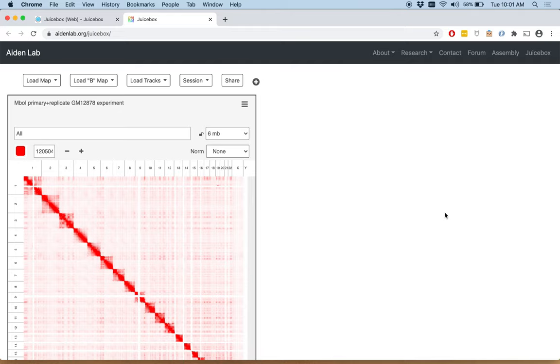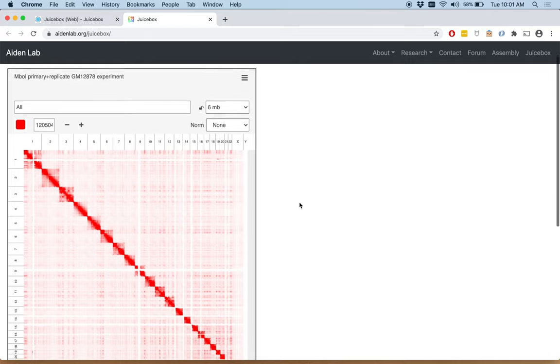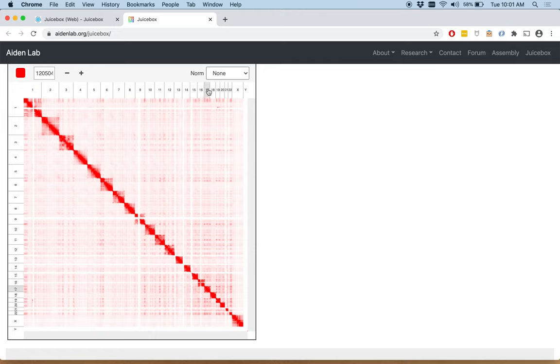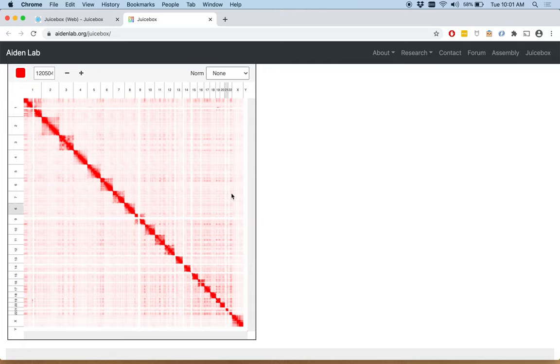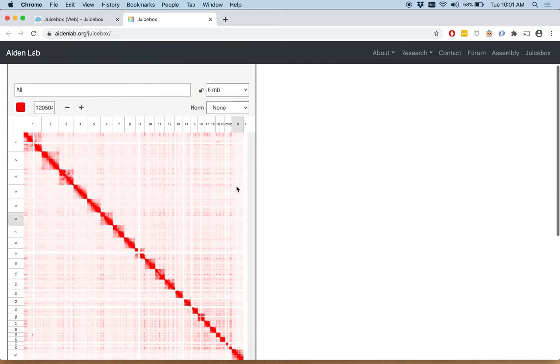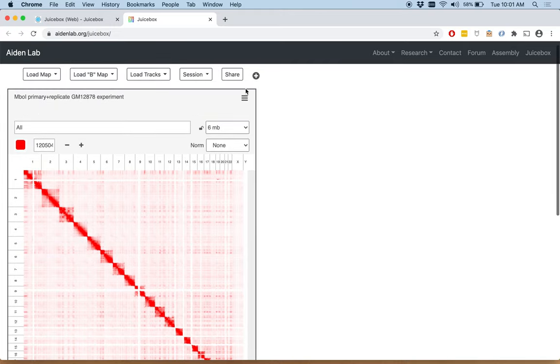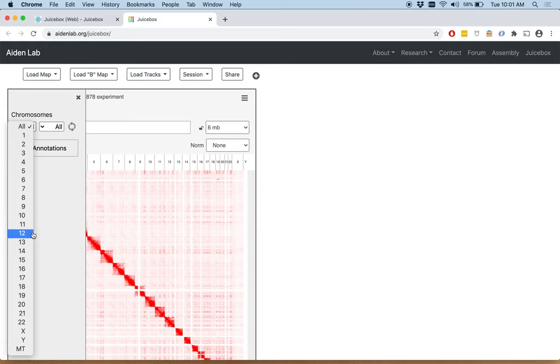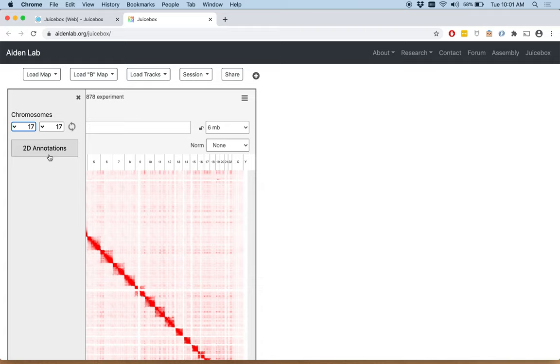Now let's zoom in to chromosome 17. There are several different ways you can do so. You can go to 17 in the chromosome picker boxes on the axes, you can go to the box itself and just click, or you can use this hamburger icon, these three lines. Click that and scroll down to click 17 and click refresh.